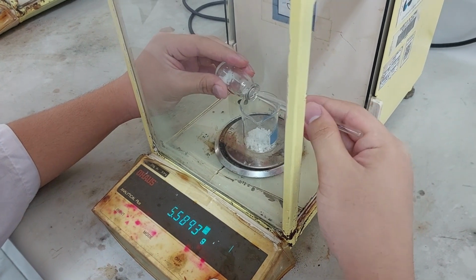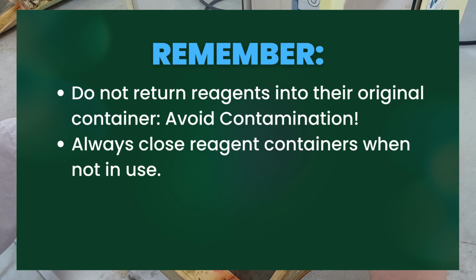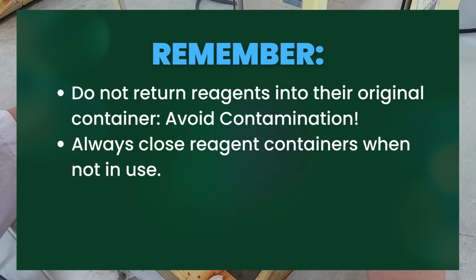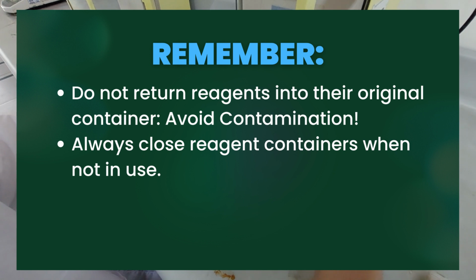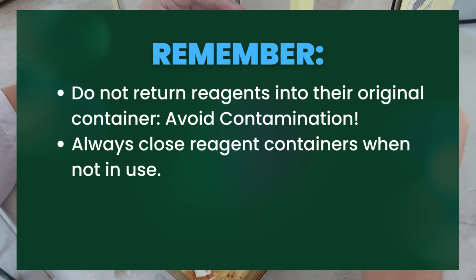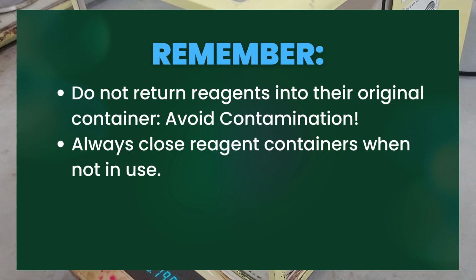Here are some important reminders when weighing. If you happen to take too much of a reagent, do not return it to its original container, as it has already been exposed to the environment and the instruments used in collecting it, making it contaminated. In the same way, always close the container of the reagent when not in use, to prevent it from being exposed to the environment and to ensure that it does not become contaminated with impurities.